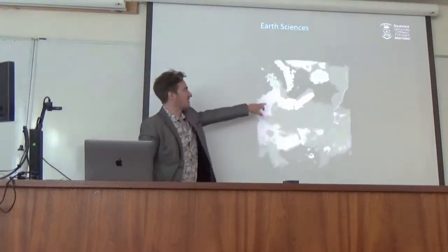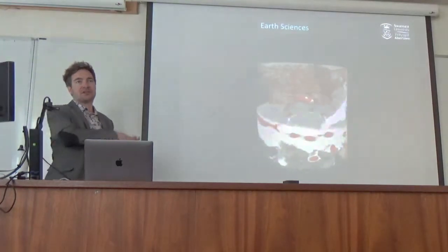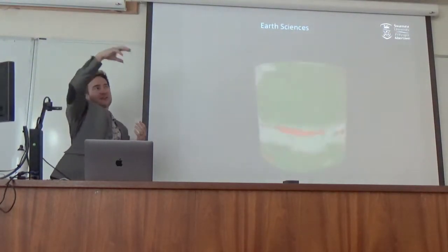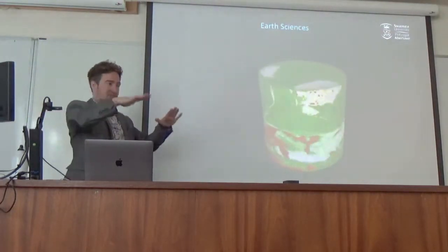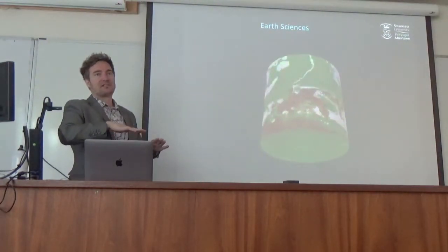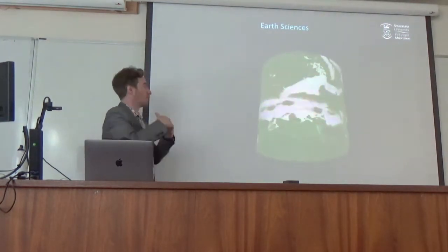The white visualized here is actually volcanic ash. When you get a volcanic eruption, volcanic ash goes into the atmosphere, travels quite far actually, and then is deposited over the ocean or over lakes and gradually drifts down to the bottom. And so we can date volcanic events based on their position vertically within those core sediments.